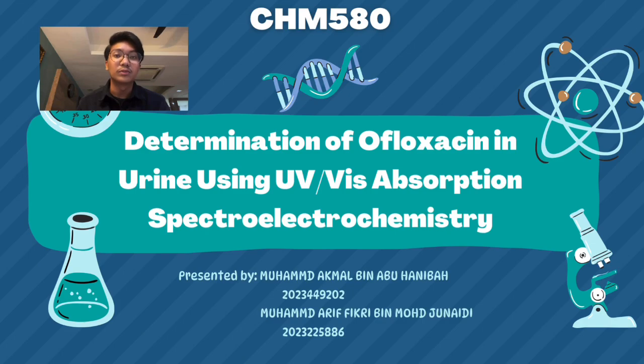My presentation today is based on a research article titled Determination of Ofloxacin in Urine Using UV-Vis Absorption Spectroelectrochemistry. This study focused on detecting the antibiotic ofloxacin in urine using a combined spectroscopic and electrochemical technique.